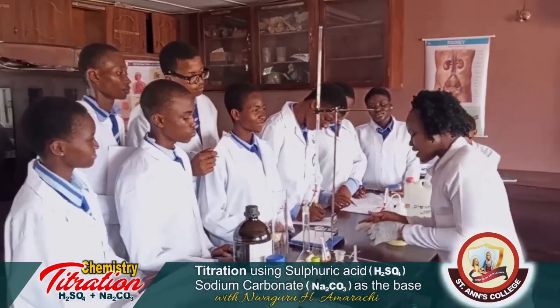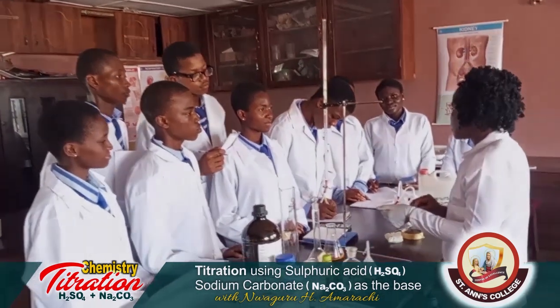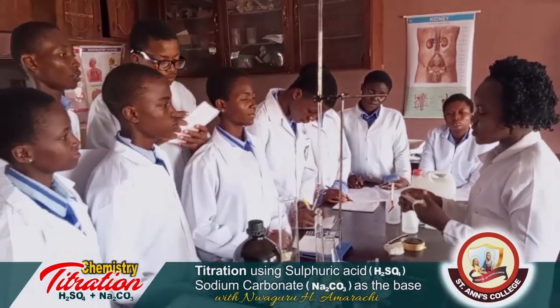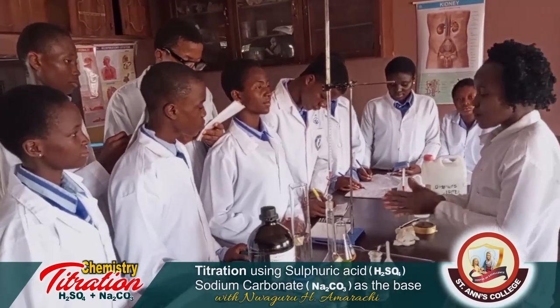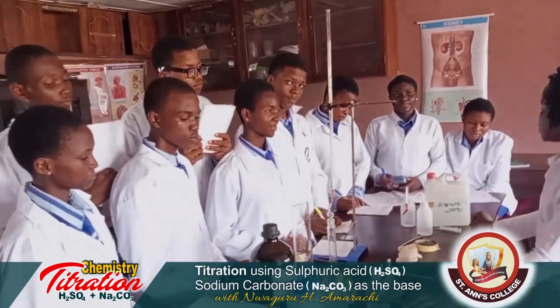So neutralization of acid and base giving salt and water is no longer news. You have carried out the practical and it's confirmed that it gives what? Salt and water. Good. Here is the end of our practical for the titration.